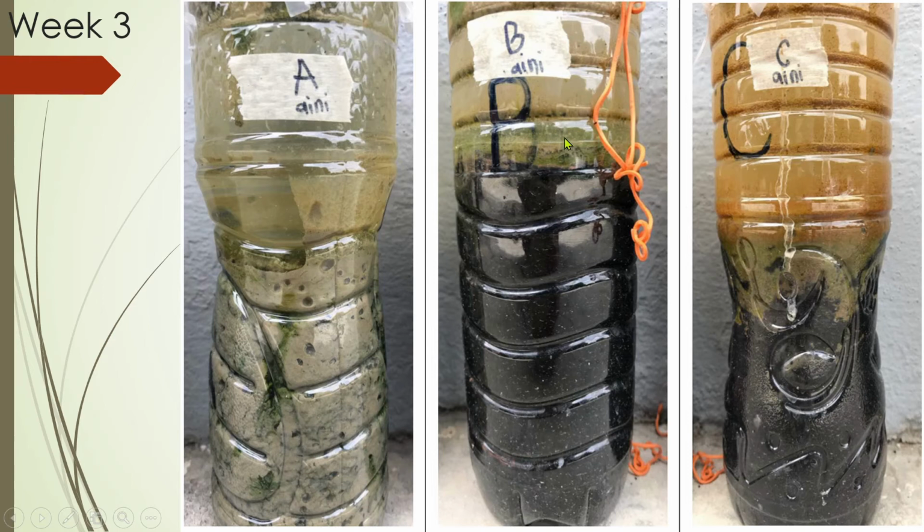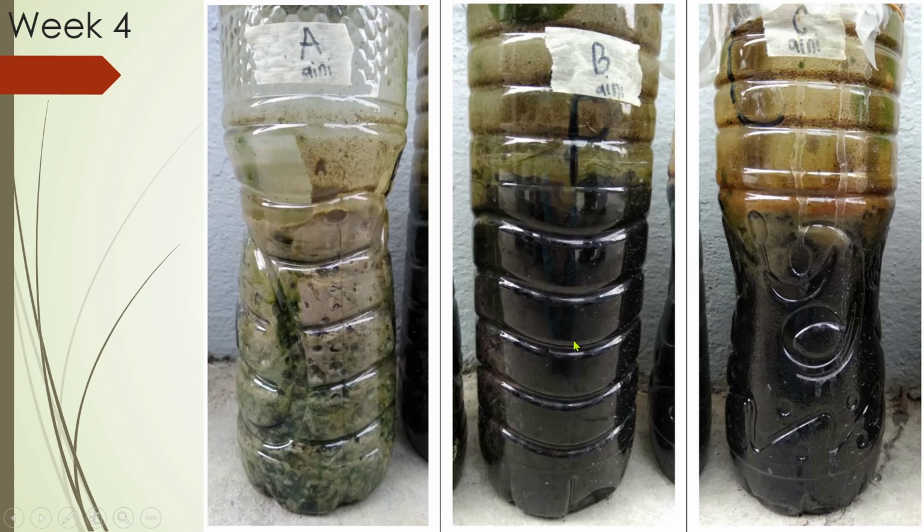Another clear difference is the orangey tinge here, probably from the ferrous addition in this column. By week 4, you begin to see a purplish tinge in column B, and here the orange tinge still remains around here.